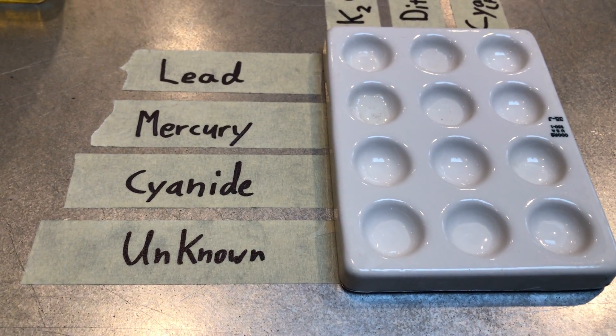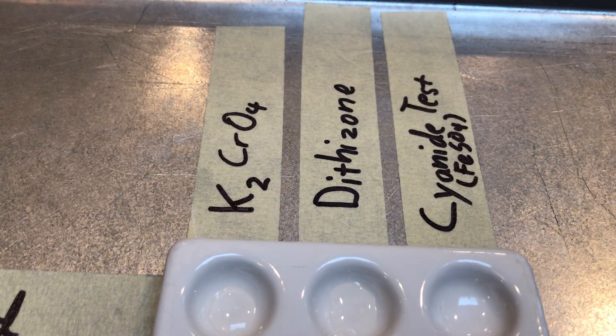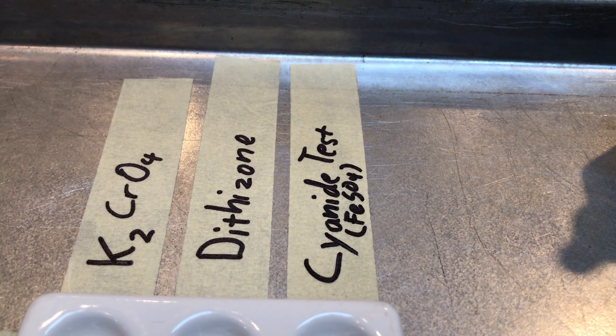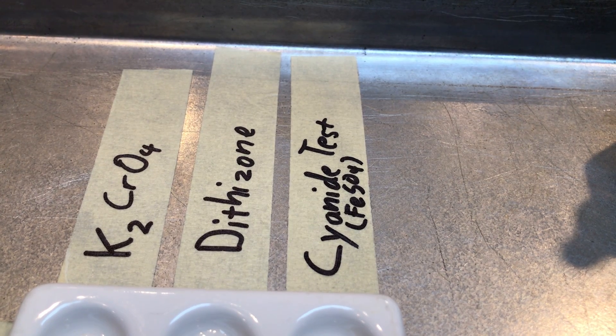The reagents we are going to be testing our poisons with are K2CrO4, which is potassium chromate, dithizone, and then we're going to be doing a special cyanide test for cyanide, which involves ferrous sulfate, FeSO4.